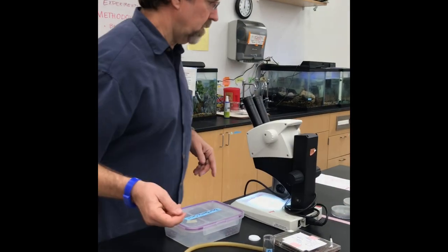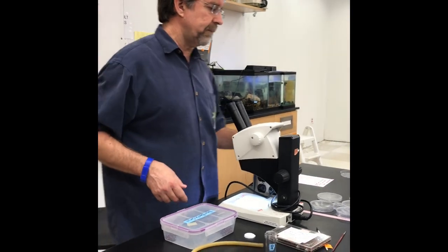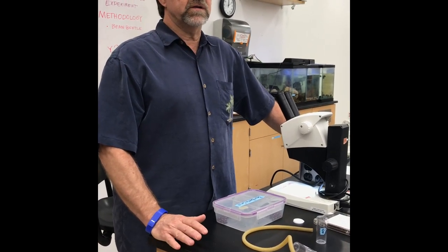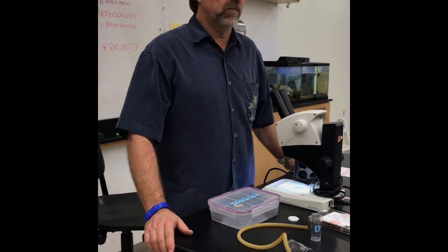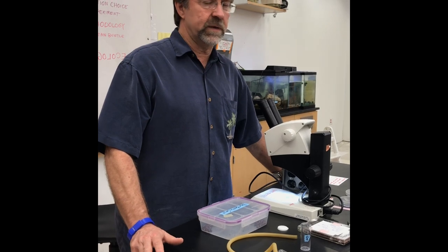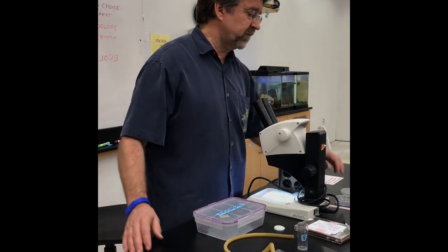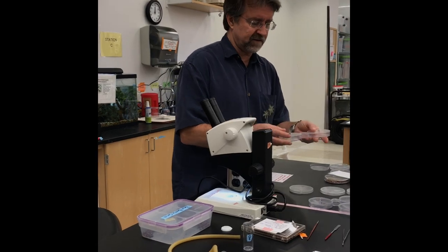For your experiment, we suggest you have access to 10 males and 10 females. You don't really need that many males. We suggest that you set up your three treatments. There are a variety of different ways to do that.